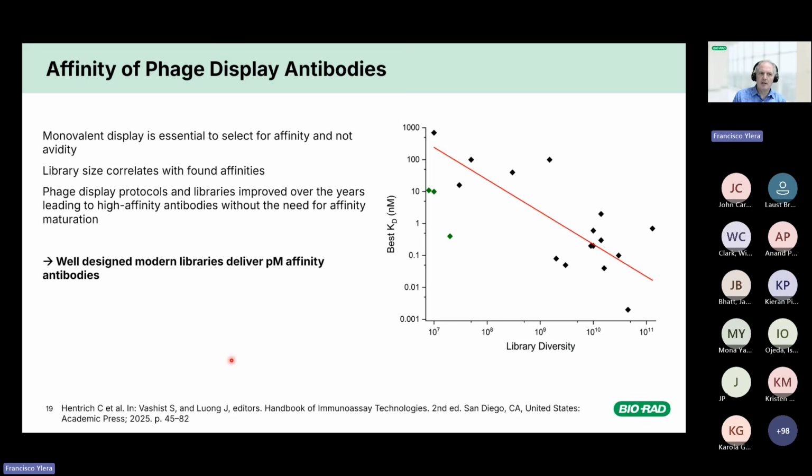So, for example, if you have an antibody with a monovalent affinity of 10 nanomolar and another with probably 500 picomolar, then in a bivalent format, you cannot really distinguish between these two anymore because with the washing conditions during phage display, they both show similar binding properties, and the high affinity candidate would not have an advantage anymore. And so if you don't have a monovalent display, then you cannot really select for high affinity, and the resulting antibodies are all good to medium affinity.